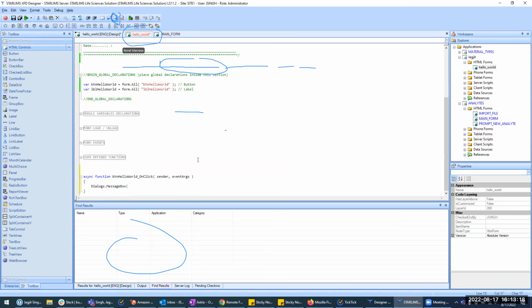So that's an idea of global find, studying it and seeing, but we got a little too involved, right? So just put string, right? Double quote and hello world. Gotcha. And then, yep, let's do one more, comma. And then this is a caption. I want to see how the caption shows up. So this is a caption, yep. And then close that, semicolon at the end. Okay, so now when we click on that, we should get a nice little message box.